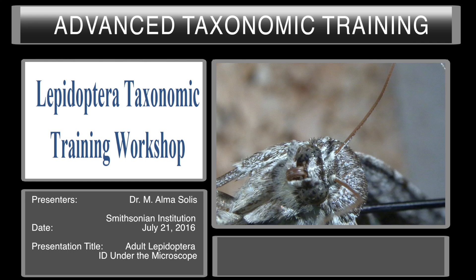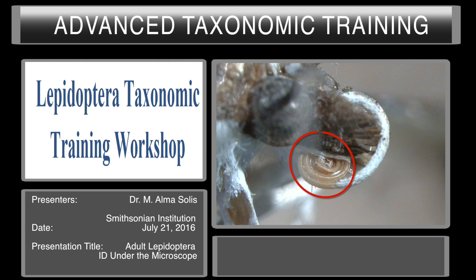Here you have another moth and the moth head. Here's the proboscis. As you can see, there are definite scales at the base, then the rest of it continues on without scales. Many times you will see scales just lying on top of the proboscis. If they're not in an organized state like this, where you can see that they're flattened in a pattern, then it's just scales that accumulated from the trap or just from moth scales flying.